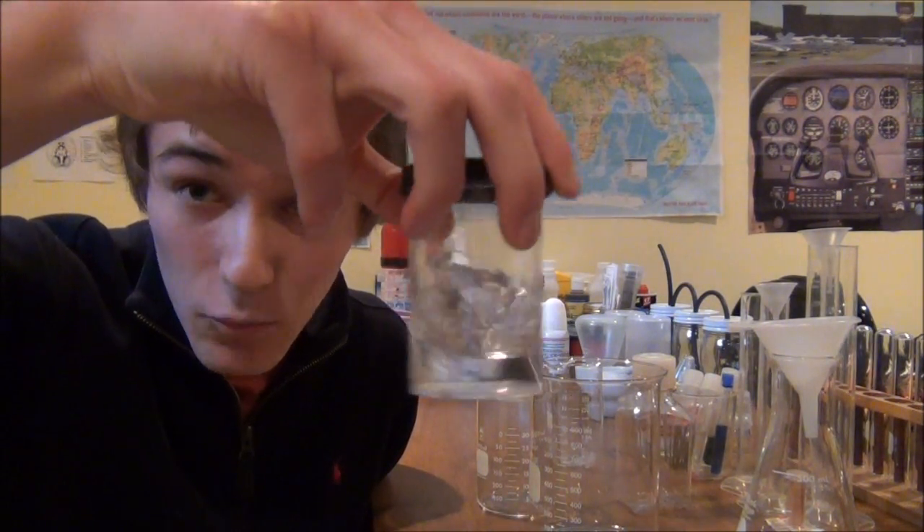We're going to be working with this substance right here today, which is lime water. Why do they call it lime water? That's actually a good question. Lime is just sort of a generic term in chemistry for anything that contains calcium — so usually we're talking about carbonates, oxides, hydroxides.